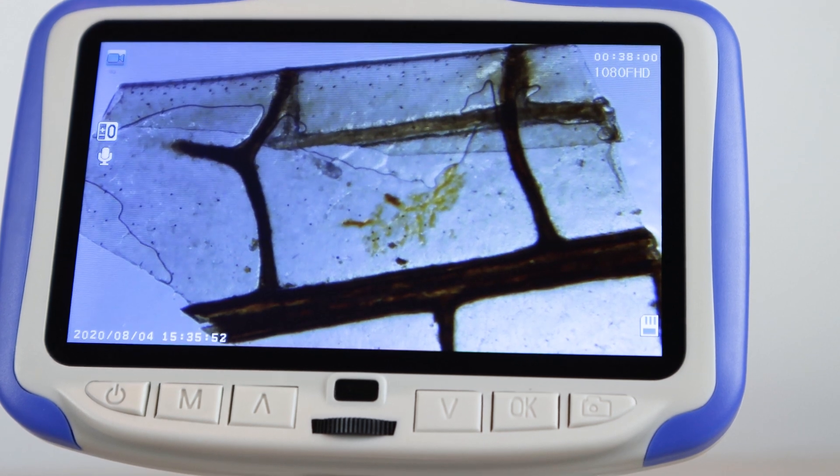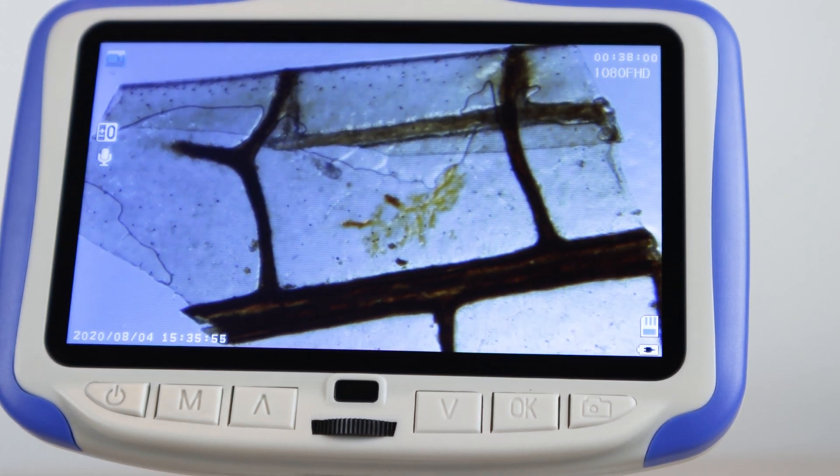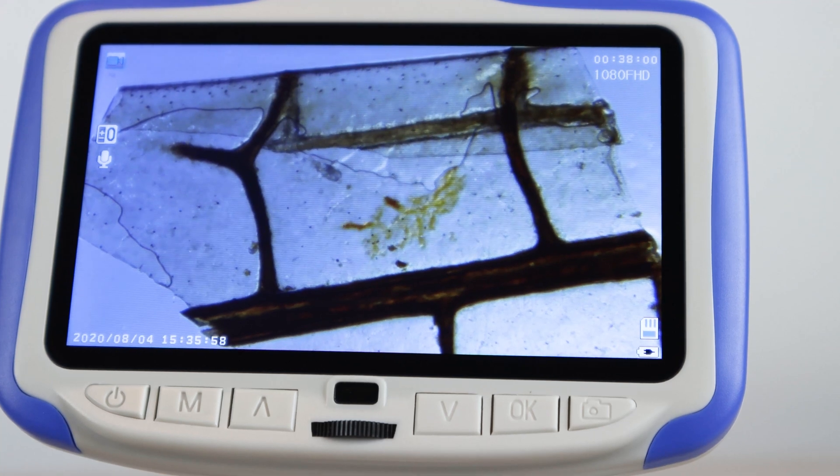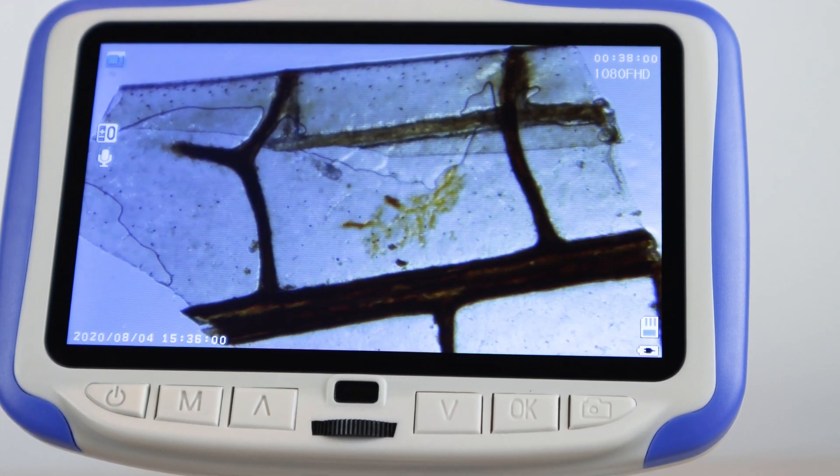With the translucent filter, we can definitely see more layers of the sample as edges are better defined and we get less reflection from the adhesive holding the sample to the slide.